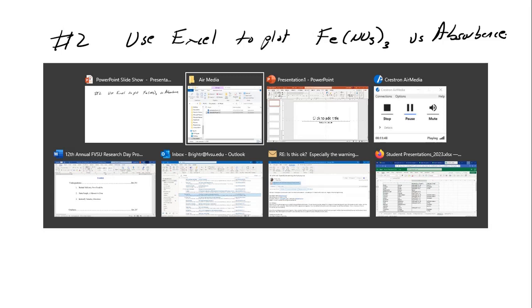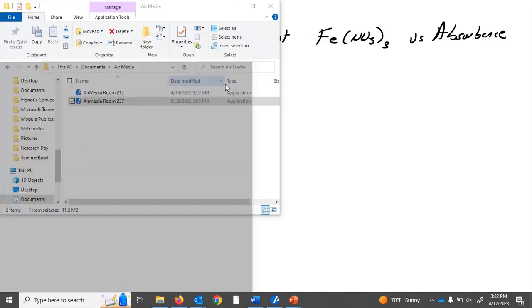For number two, I'm going to use Excel, or you can use Google Sheets or something else, some spreadsheet program, to plot the FeNO3 concentration versus absorbance. That's what I forgot to do with startup Excel, but we'll get there.